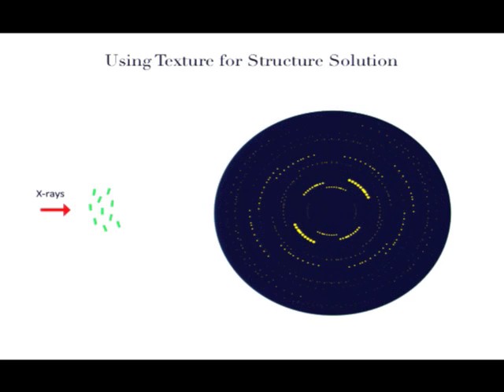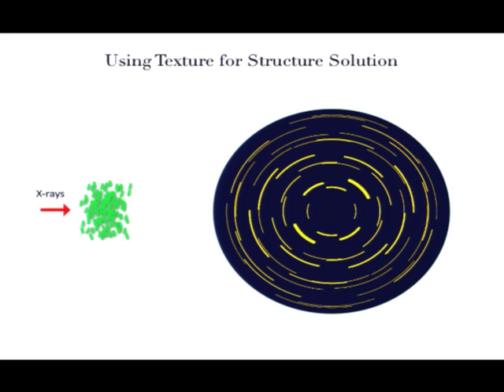When I have aligned crystals, my reciprocal lattice points are concentrated in one area. It doesn't matter if I have a lot of crystals, if they are aligned, I have not a complete ring anymore. And if I look again at the overlay, the reciprocal lattice, I see that the four reflections are now separated, to some degree at least.